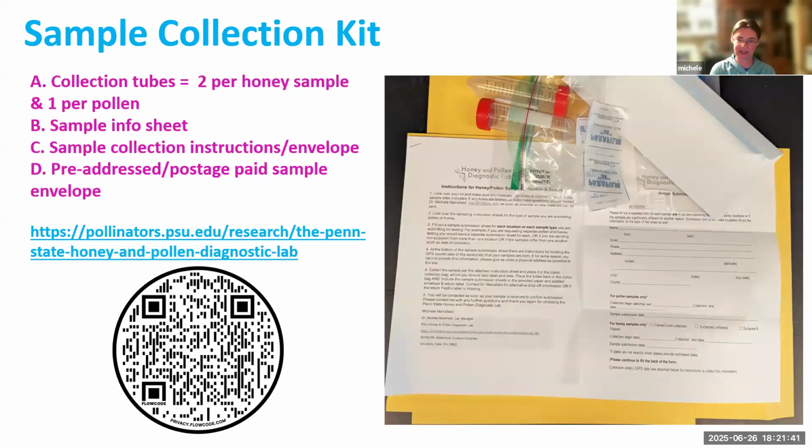Okay, all right. So I don't know how many of you have received a sample collection kit. Hopefully they look much better than the one in my picture. This was literally a last minute thing, and I can get some better photos and update my talk at some point. For sample collection, the kit consists of everything that you're going to need. If you're collecting honey, I ask for two full tubes per sample, and one tube if it's pollen. It doesn't necessarily have to be full if it's pollen, but usually I ask people to give me up to the first tick mark, which is roughly 5 grams.